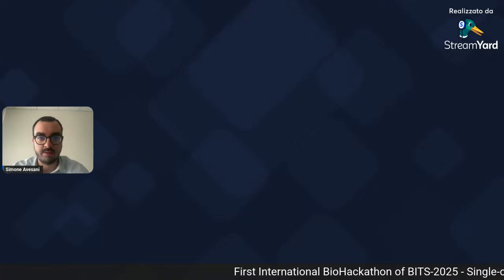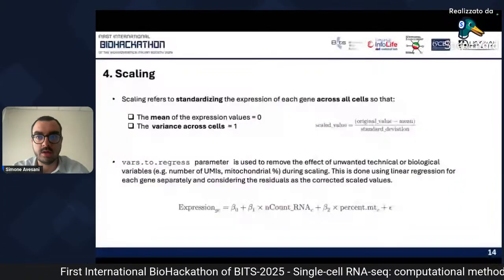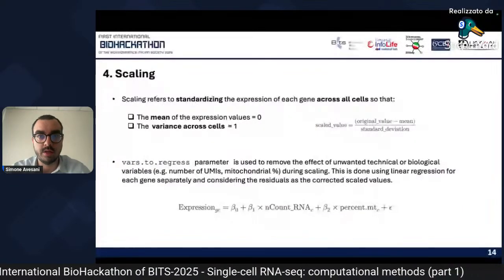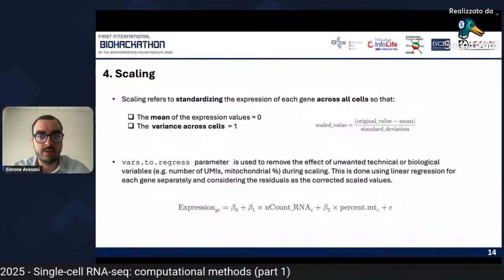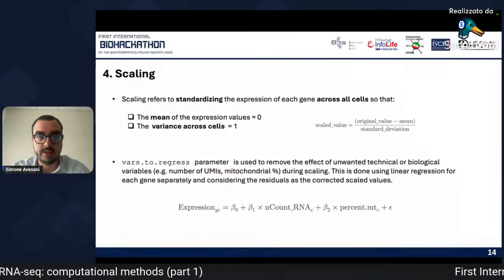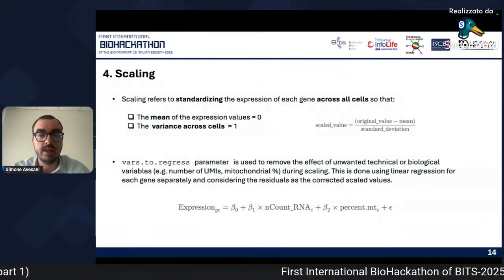Okay, so good afternoon, everyone. I'm Simone Avesani. I'm a postdoctoral researcher at the University of Verona at the Department of Computer Science. And now we will continue with the analysis and preprocessing of single-cell RNA-seq data.